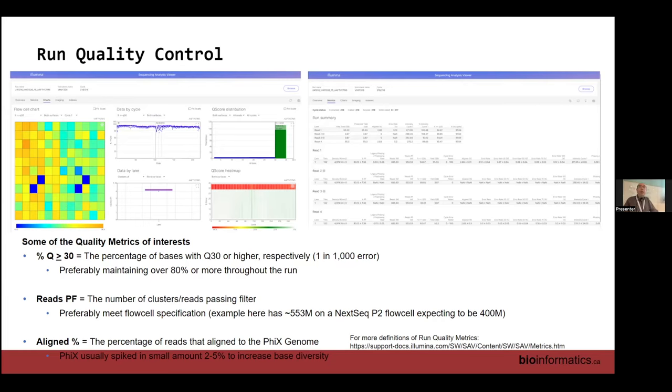All right, so where we left off is I went through this morning in the molecular, literally from samples all the way to preparing the libraries and then sequencing your samples on the instrument. The last part was seeing how an instrument is being operated and loaded. So that's where we left off. To carry on, I'm going to spend just a few minutes on the last few slides of my morning presentation, and then we'll go into an exercise activity.